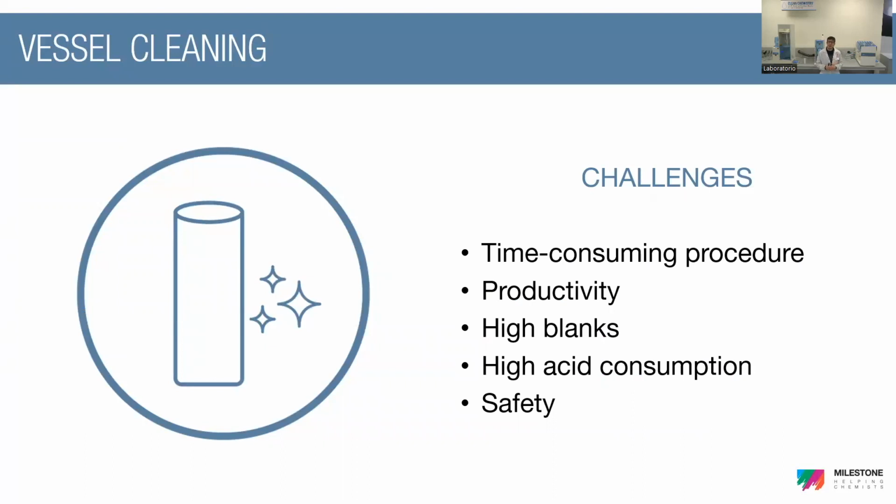The efficiency does not allow us to reach very low levels, so the overall level of blanks is high. And last but very important to consider is productivity, because both these approaches, the soaking as well as the microwave-based cleaning, strongly and negatively affect the overall throughput of your laboratories.